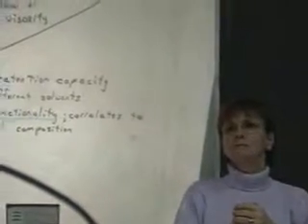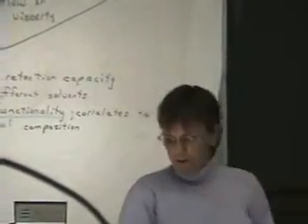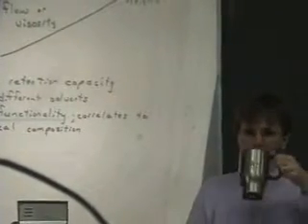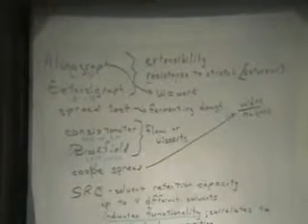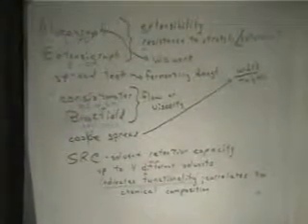You can try 4 different solvents at one time? No, you have to have 4 different samples. So you've got flour plus whatever the solvent is, like 5% sodium carbonate. So it'd be flour plus solution of 5% sodium carbonate. Shake those together, let it set, centrifuge it, pour off the liquid, weigh it. How much did it hold on to? With no water on that test? Well, the 5% carbonate is 5% in water. Okay. So they're all water-based.